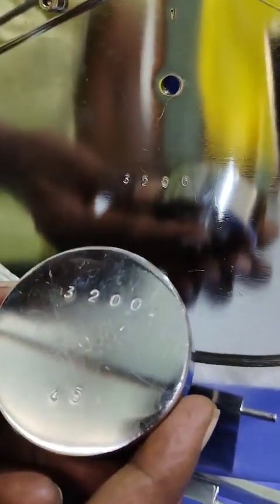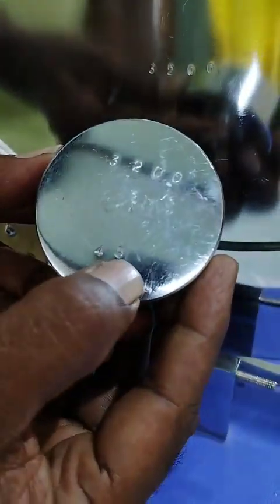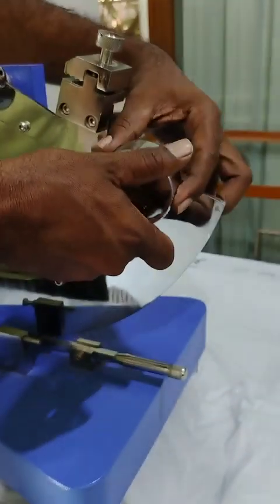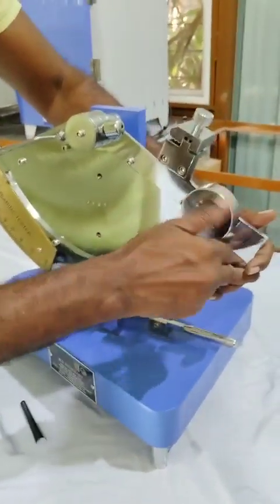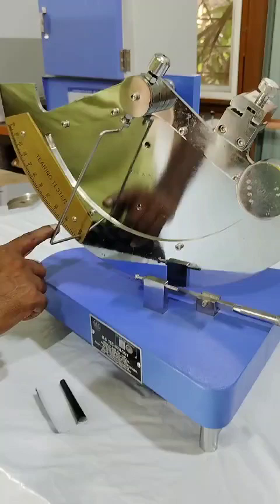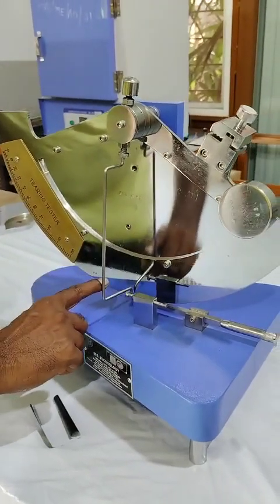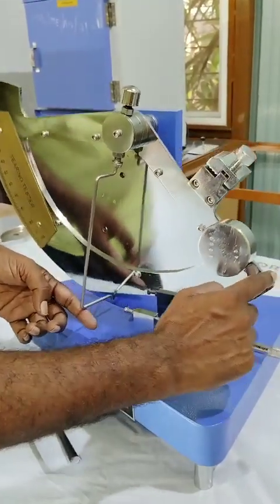Here you can see the number on the plate is 3200 and the number on the weight is also 3200. Attach this weight to the pendulum. Then again set the pendulum perpendicular to gravity and bring the pointer back to the initial position.